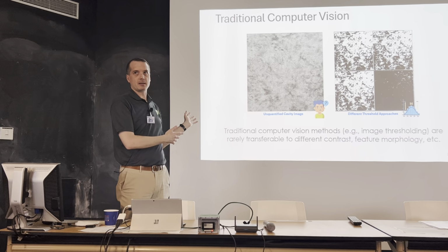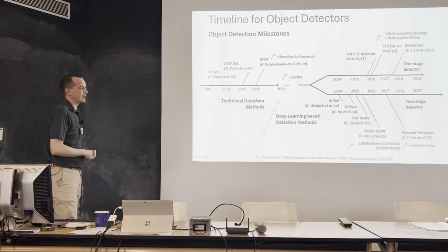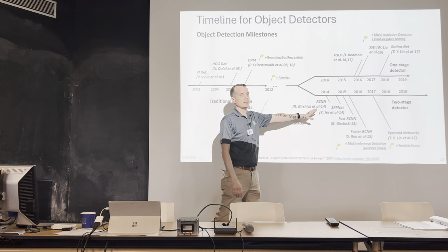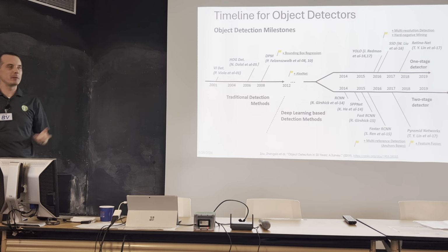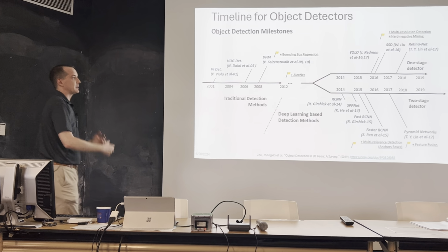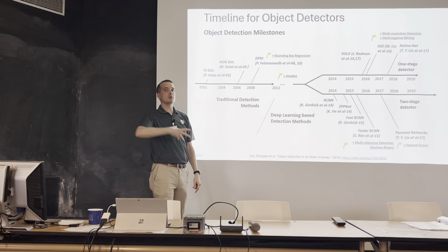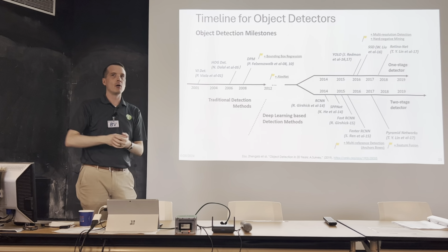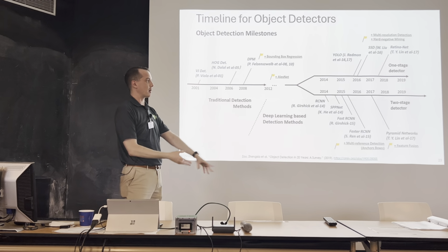So there have been attempts at this over the years, and this is a little bit different because 4 years ago this was not the case, but now we know that there are all of these other methods, and deep learning, machine learning has, I don't want to use too many hype words, revolutionized what we're looking at now, right? Because it can account for the contrast and background changes. It can be better than those traditional methods of computer vision, or it can at least be used to augment that, and you can have a hybrid one, and now you can get it to work on all of your images, or at least get to where 99% of your images are being quantitated as opposed to being thrown out.